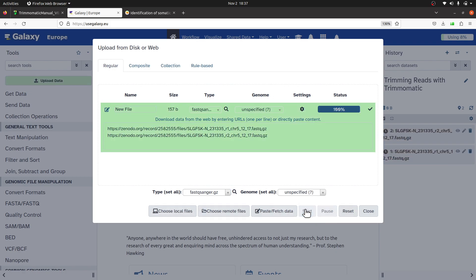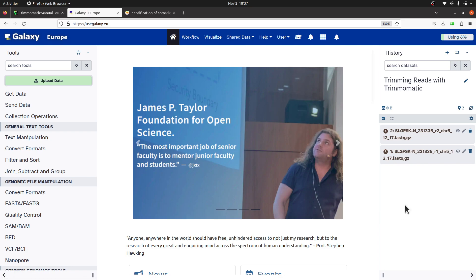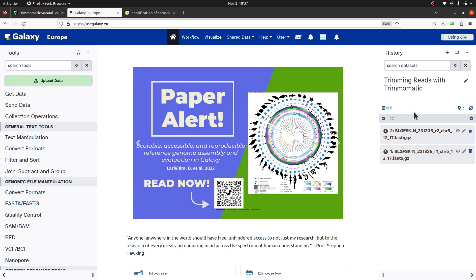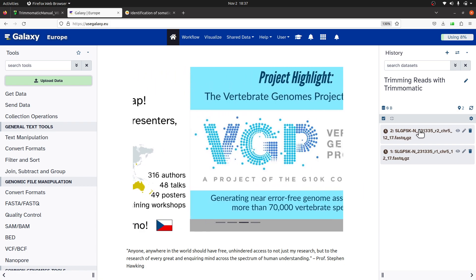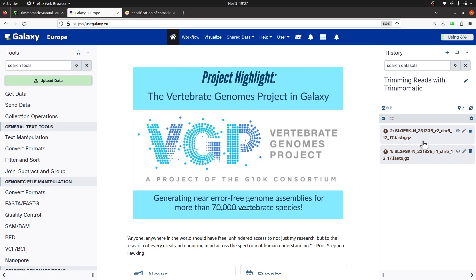Click Start. Once you do, you should see that the status is 100 percent and some output is generated. You can then close this dialog. At the moment the outputs have a gray background, which means they are in queue. We will have to wait for the files to be imported. When everything is done, the background will turn green.